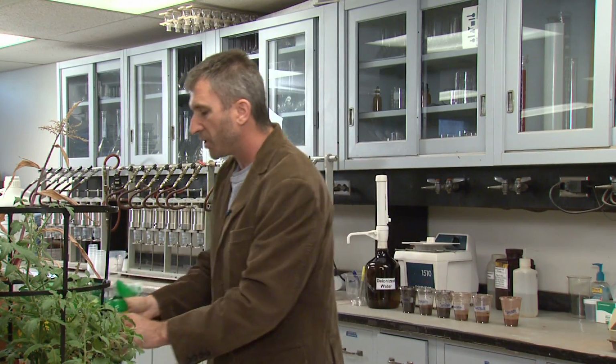Now, sometimes a farmer will have a field where they know that there's more than enough nitrogen, phosphorus, and potassium for the plant, but the plant still isn't growing well. And in that case, they may start wondering if there's not a deficiency of some other nutrient in the soil, perhaps zinc, perhaps copper. In those cases, she'll get a soil sample and she'll send it to the lab here at OSU. And in addition to asking for nitrogen, phosphorus, and potassium, she'll also want to know the amount of other nutrients in the soil.